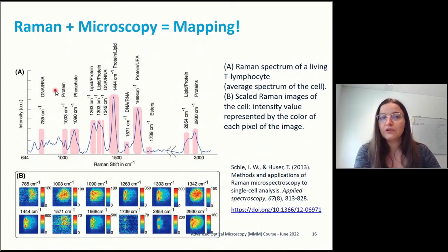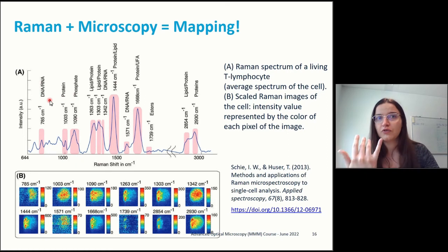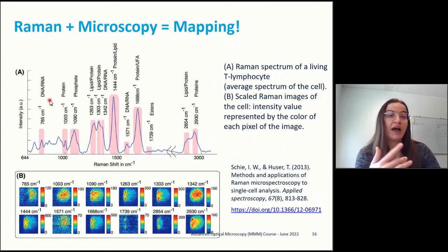And you might want, since we were seeing before that you have different types of bands for different things, you could ask, since you are collecting the whole spectrum every time, if you give it the proper range where you want to collect, you might as well ask the processing software to just track different things.